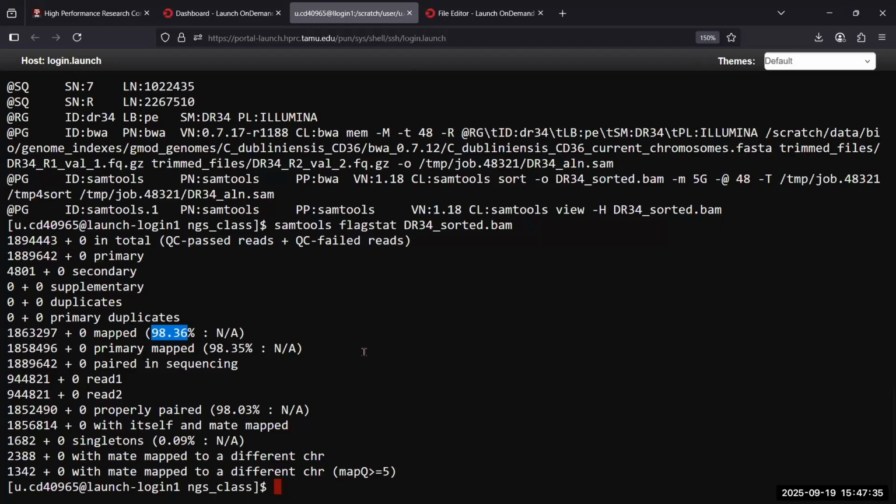Why didn't some reads align? It could be that your sample has DNA sequence that's not in the reference genome. So it can't align to it because it's not in the reference, but it's still part of your sample. So there's 2% of the reads that might be a small DNA insert that's not in the reference genome, but it's in your sample. Properly paired means it's on the same chromosome and they're oriented forward and reverse. If one maps to chromosome 1 and one maps to chromosome 7, they're not properly paired.